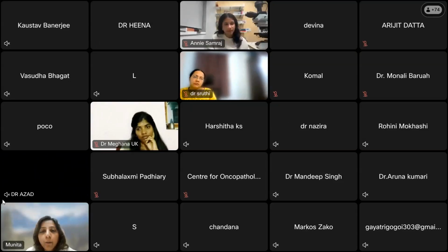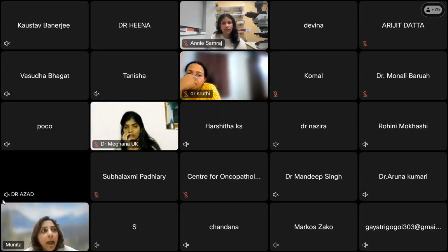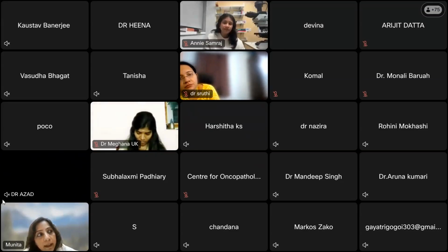And here, I work in a cancer center, and it is a high volume cancer center. We do a lot of pancreatic resections, on average about 100 a month. And in this part of the world, we have more of ampulla. So we come across a lot of ampullary primaries rather than the pancreatic, also because the pancreatic hardly make it to the operating table. But in a month, about 60 to 80 ampullary primaries are done, and much less pancreatic primaries. And now we get mostly post-neoadjuvant.